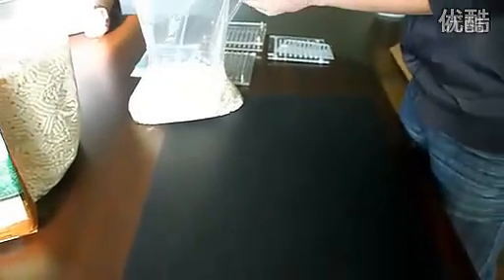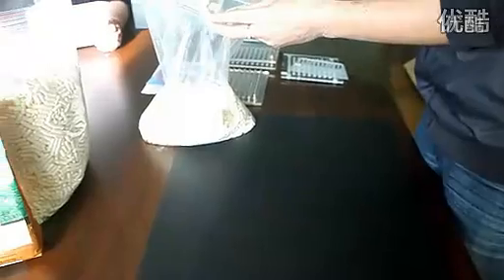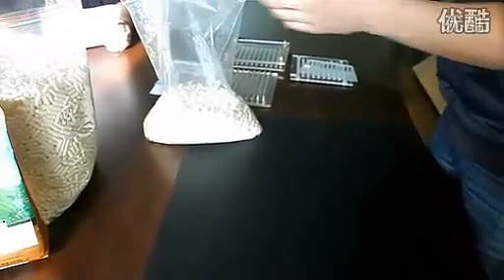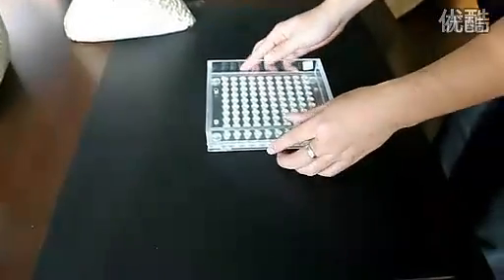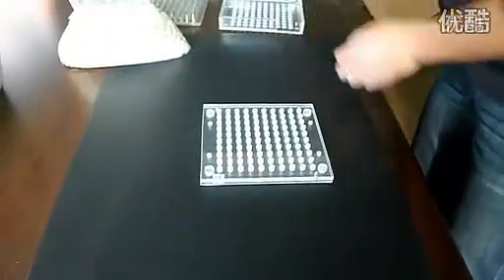When the holes are filled, pour out the excess tops. Remove the encapsulation sheet and put the filled cap sheet to one side.